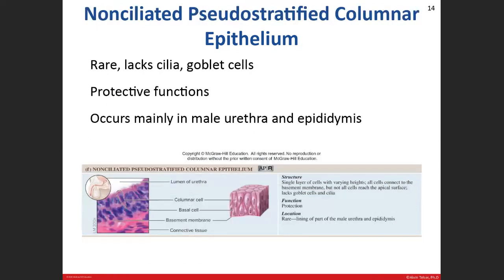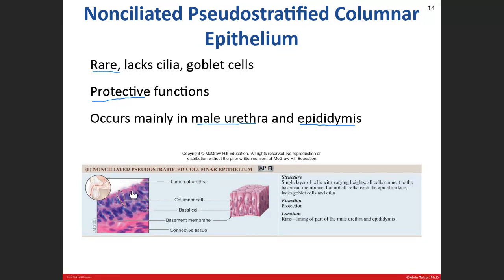The non-ciliated pseudostratified columnar epithelium is rare. Since there are no cilia, there are also no goblet cells — it would be problematic to produce mucus with no means of moving it. This type has a protective role and is found in the male urethra and the epididymis — the ridge-like structure that sits on top of the male testes. In the slide, the nuclei give a stratified appearance, but all cells contact the basement membrane.